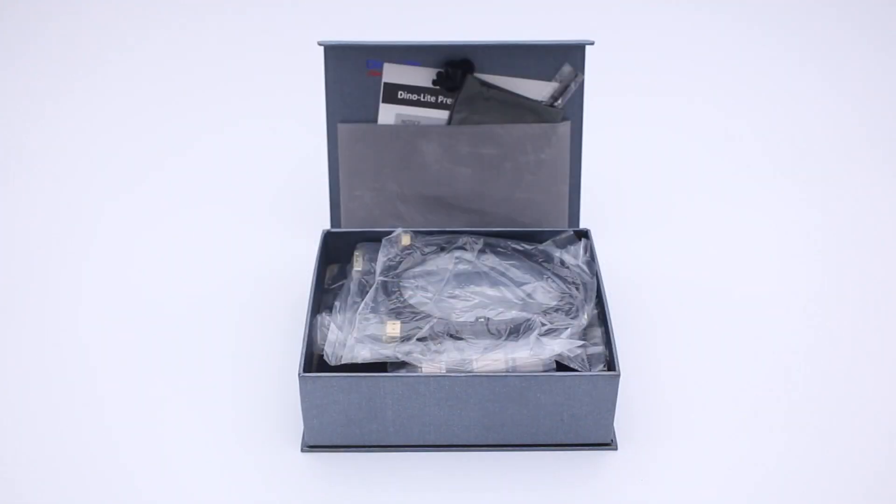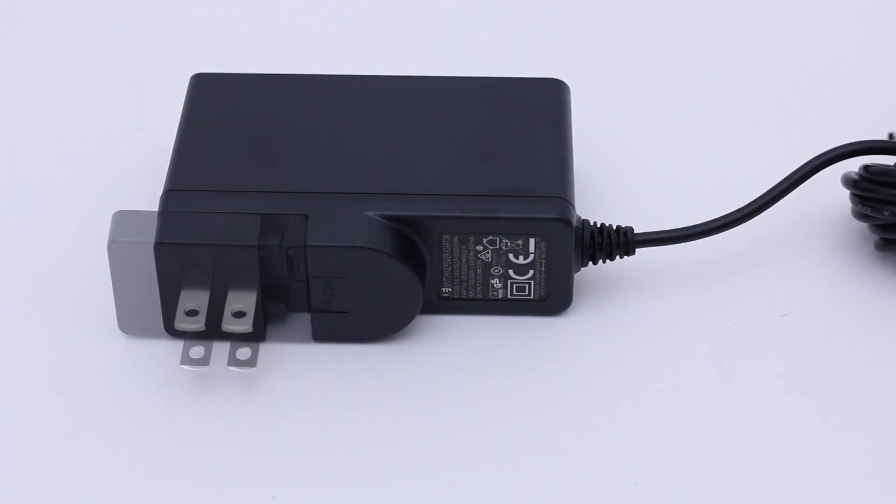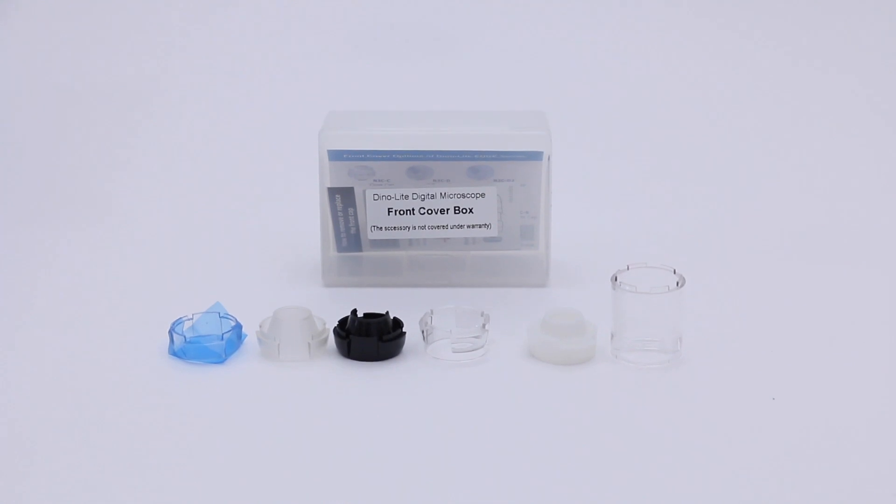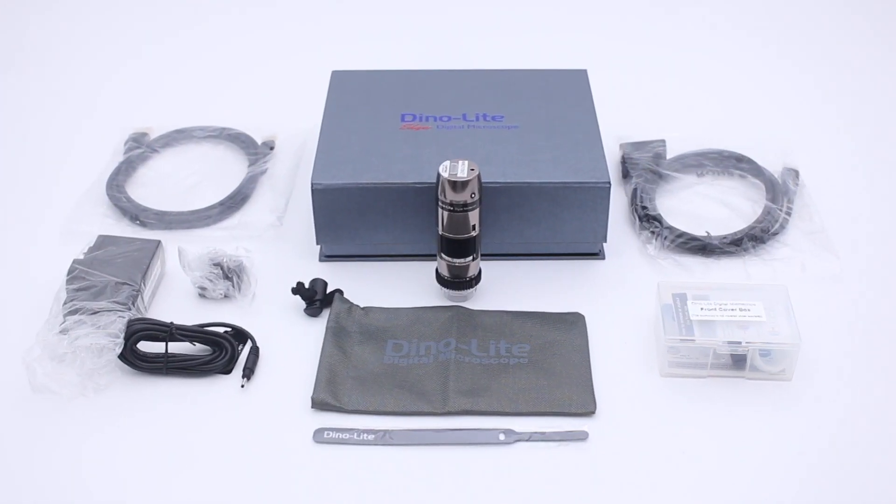Let's see what's inside the box here. You will find the DVI and HDMI cables, power supply, interchangeable caps, storage pouch, velcro strap, and of course the microscope.